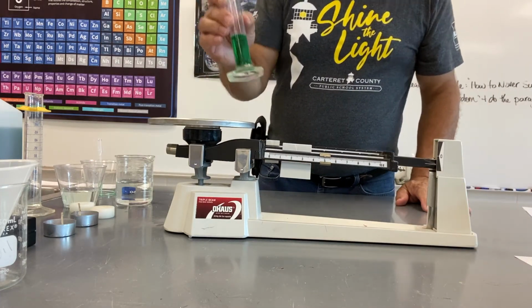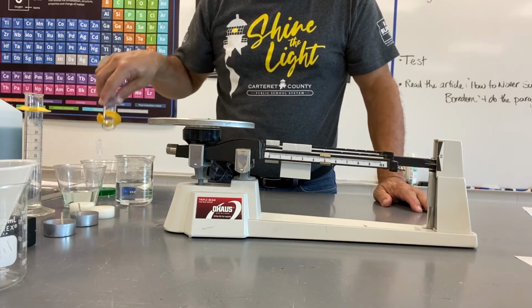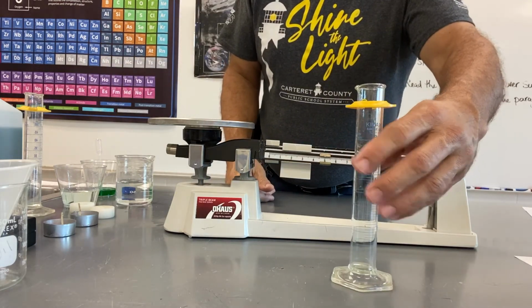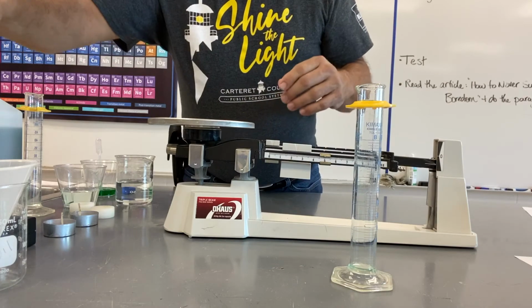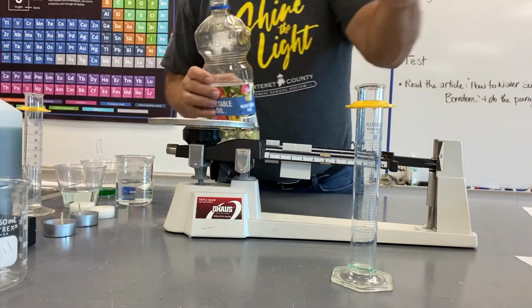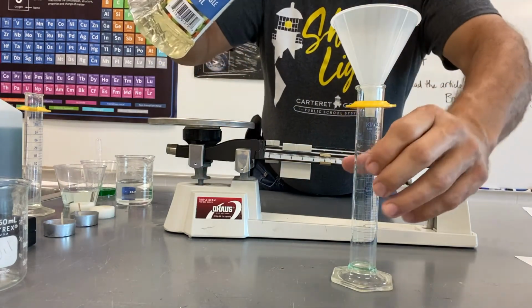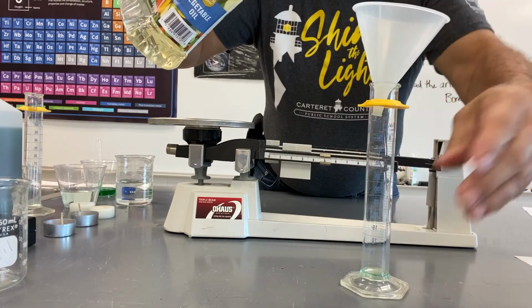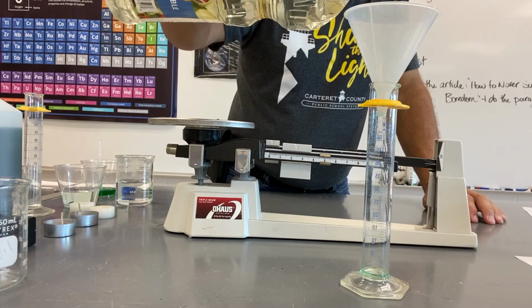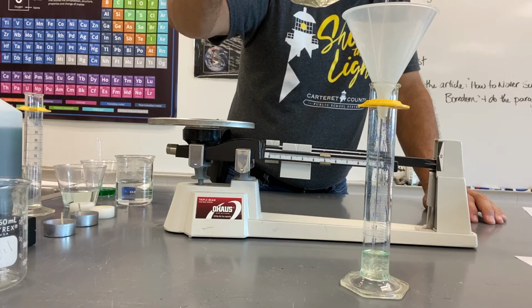All right, I'm going to pour the alcohol out. And now we're going to use the vegetable oil. If you're doing any of this kind of thing at home, it's really important that you do the vegetable oil last, because it's really hard to get the oil out of these things. It takes some seriously hot water to do that. So this is going to be hard to clean. I'd have a contaminated cylinder with oil in my water, oil in my alcohol, had I done the oil first. So that's why the oil has to go last here.